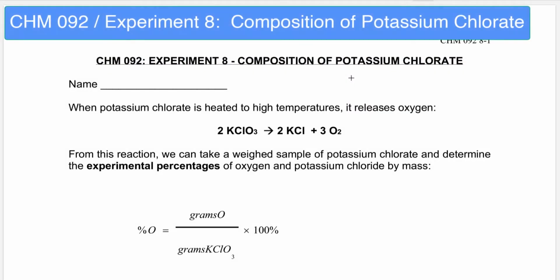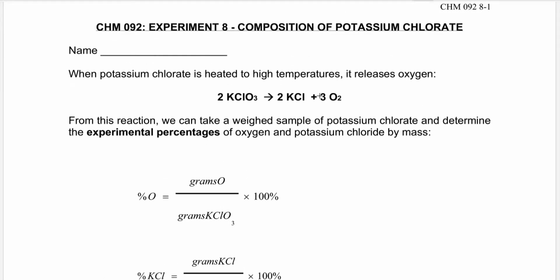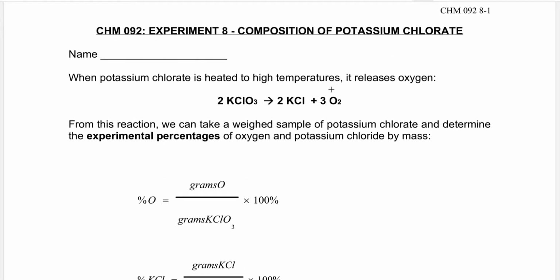In this video, I want to do an overview of experiment 8. We're dealing with the composition or decomposition of potassium chlorate. Now, there's no experimental video for this lab because the experiment's pretty simple. You take this potassium chlorate, this is a balanced chemical equation describing what happens to it.